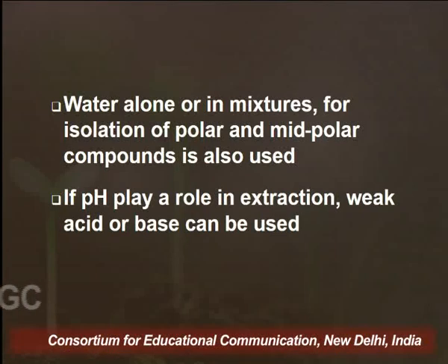We know that pH plays an important role in the extraction, and as I told you, if a change in pH is required to extract specific solutes which are pH sensitive, then obviously we should go for the use of a weak acid or base as per our requirement. Obviously strong acids and strong bases should always be avoided.